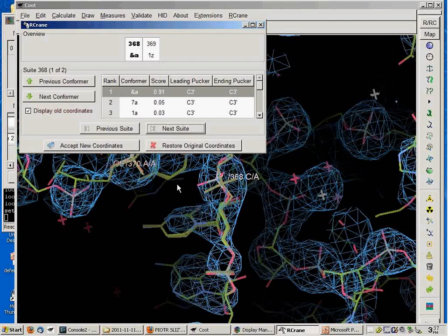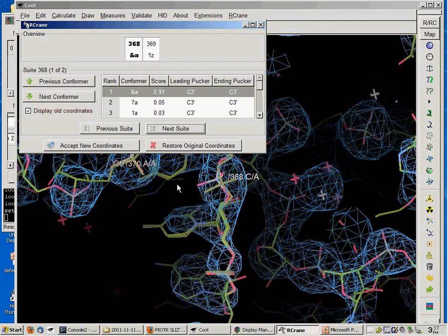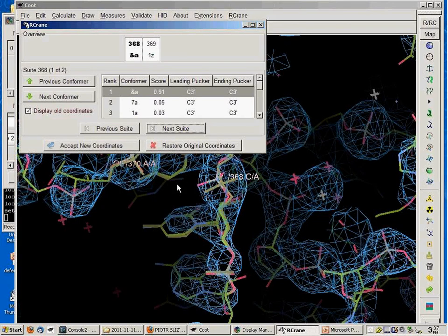Okay. And this plot you showed earlier on, is it something that is available right now within Coot, right? No, so you can't do this within Coot. You can do this within Amigos 2. I'm almost positive that's also available through SBGrid, a Java application where you can load in an existing crystal structure. I've been told that it is available. You can load in an existing crystal structure and it'll generate a Ramachandran plot for you.